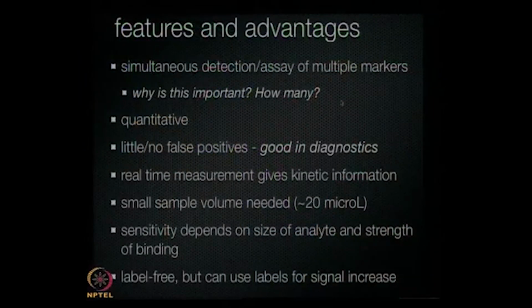It's label-free right now, but if you want to get better sensitivity, you can also add labels. So you can start with protein 1 or an antigen, you put in an antibody, and that's your binding. If that signal is too weak, you could put in a secondary to identify your antibody. That's very important, because if you're not able to detect the signal at a very, very low level, then obviously you have to have some mechanism to bring the signal up. That's right. You can amplify. Or perhaps the signal may be low and you need a good photodiode to detect it, but then you sometimes want to amplify it so that it's visible to your eye, and then you can add your secondary.